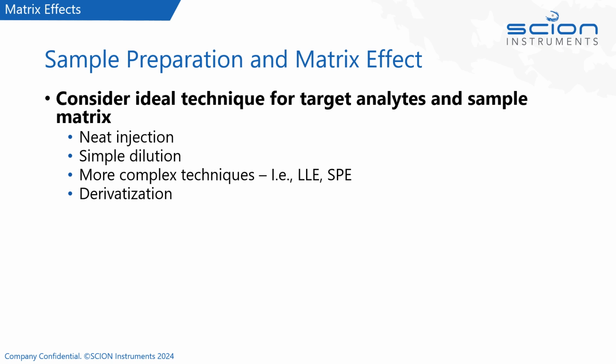It's important to note that with these sample preparation techniques, you ideally should be subjecting the analytical standards to them as well, so then you can track if there's any degradation and make sure you get an accurate representation of what's found in your sample.